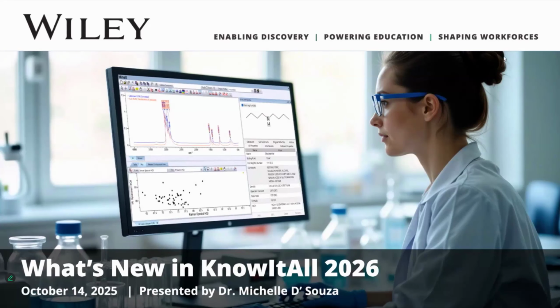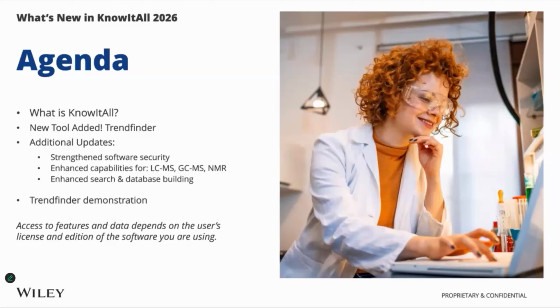Thank you for the introduction. Now we will take a look at what's new in the KnowItAll 2026 release. Today's agenda is we'll go over what is KnowItAll, the new tools added, and additional updates. In the end, we will have a Trendfinder new tool demonstration.